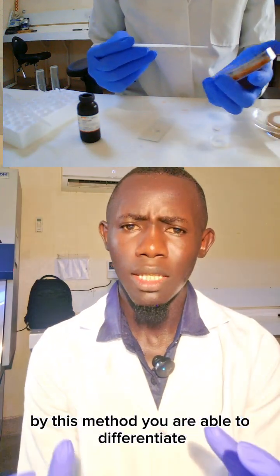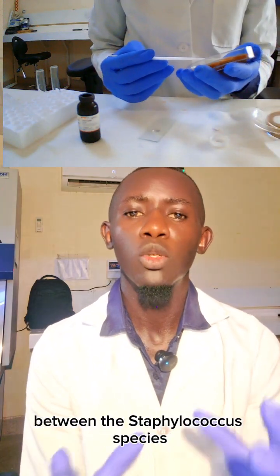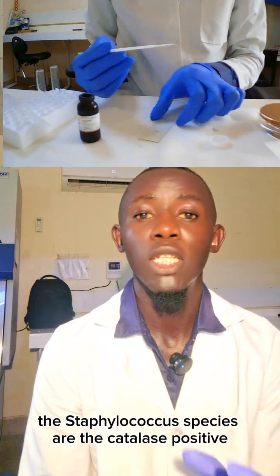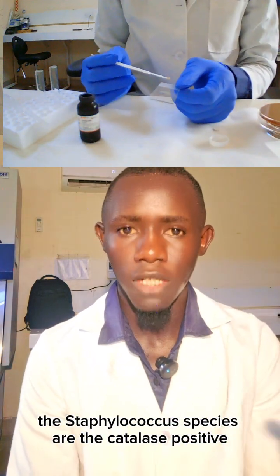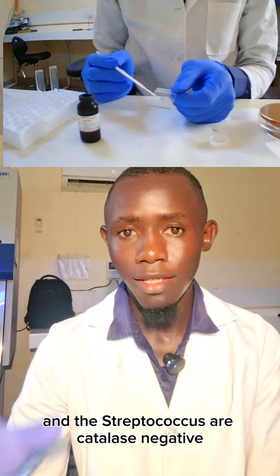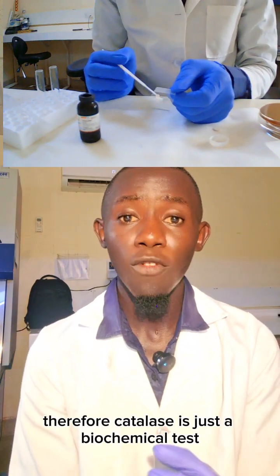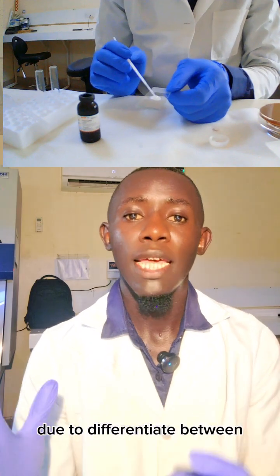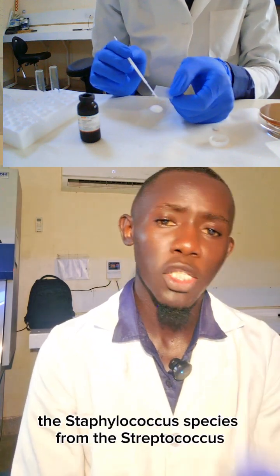Therefore, by this method, you're able to differentiate between the Staphylococcus species and the Streptococcus species, of which the Staphylococcus species are catalase positive and the Streptococcus are catalase negative. Therefore, the catalase test is just a biochemical test to differentiate the Staphylococcus species from the Streptococcus.